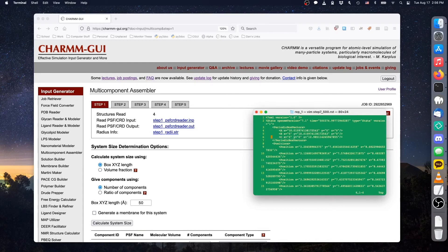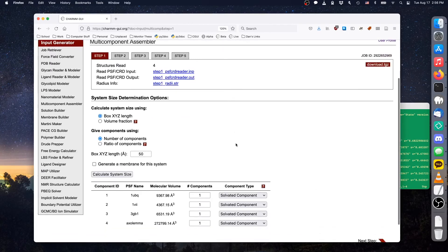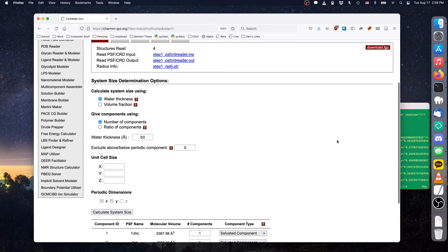However, since we removed all water molecules from this membrane system, the Z-length is no longer accurate. We are not defining the system's Z-dimension with this value, so we can simply set it to an approximate membrane thickness.